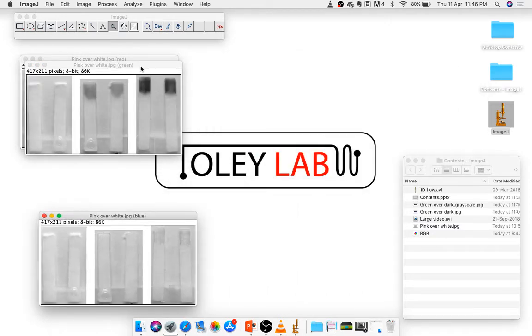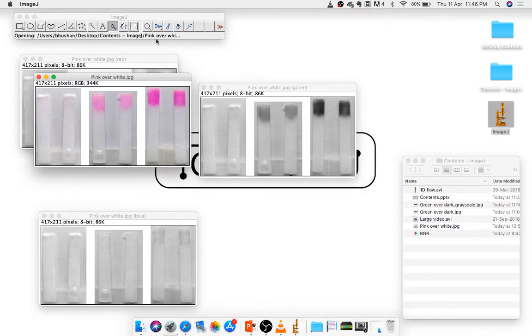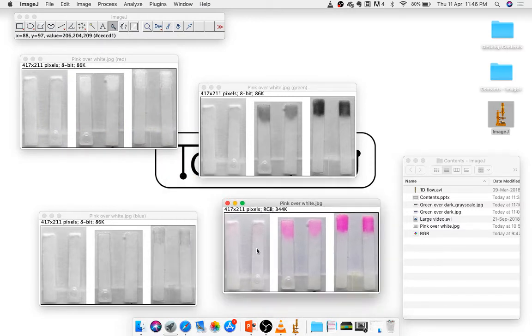One thing to note is, as I said, which color channel do I now pick for the intensity analysis. So because pink color is close to red, I'll probably open this again to go over this idea. So let's look at this image here now. White, as we know, will be represented by 255, 255, 255, or three very high numbers. In this case, you can see the numbers that appear here. They are 207, 206, and 211.